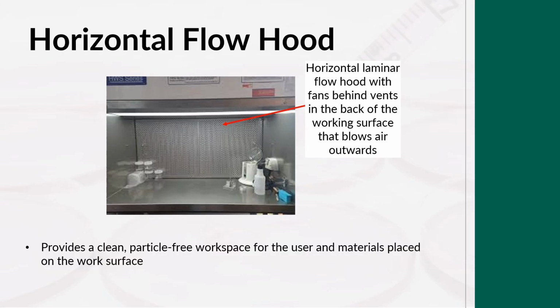Here is a real image of a horizontal flow hood. As you can see from this image, this horizontal hood has fans behind the vents at the back of the working surface and they actually blow this air outwards, all right? So this flow hood actually provides a clean and particle-free workspace for the user and also any materials that are placed on the work surface.